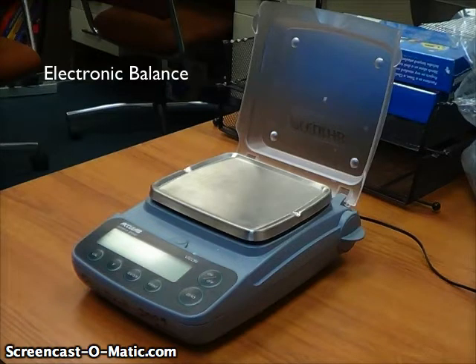The way this works is you take whatever object you want to measure the mass of, and you place it on this tray on top of the balance, and the mass is displayed in this window.